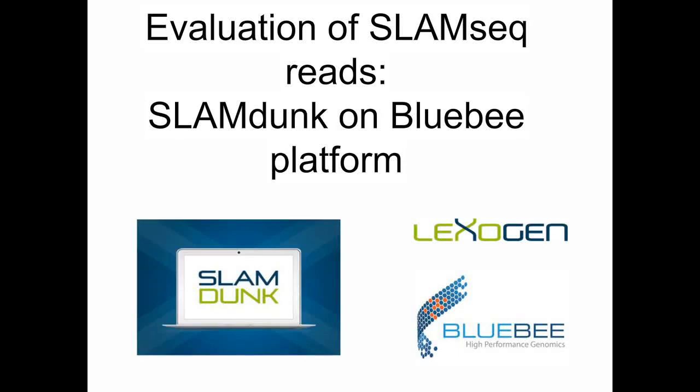Okay, and this next one is for you too. Can I use only QuantSeq library prep with SLAM-seq or can other library prep methods also be used? What is the advantage of using QuantSeq?